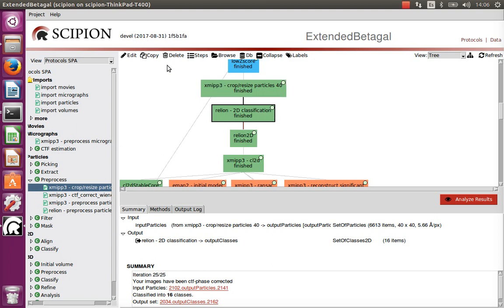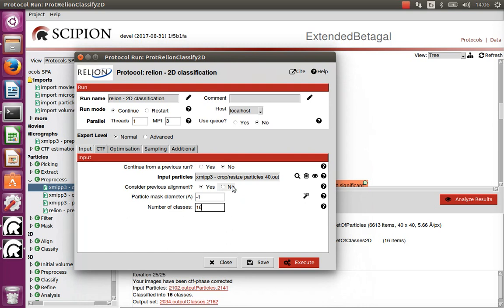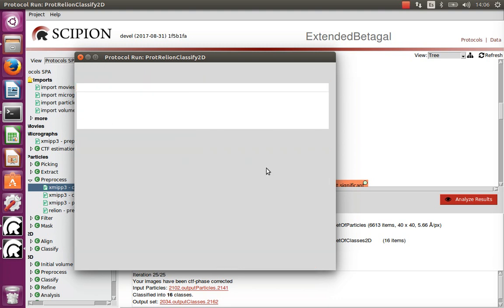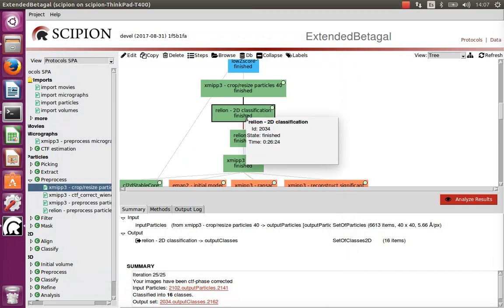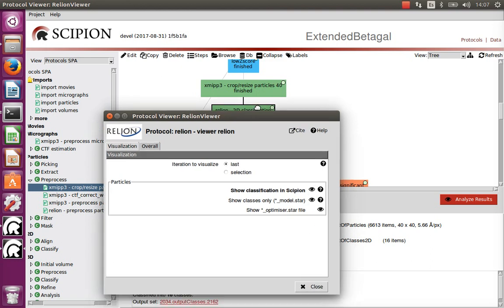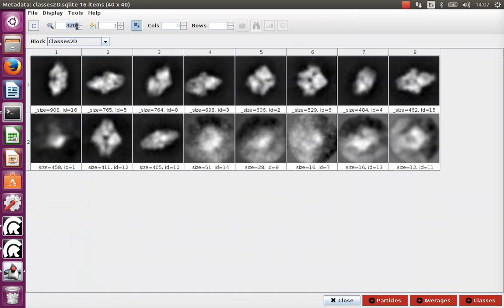The first classifier we will perform is RELION 2D. The main parameters are the number of classes and the set of images you want to classify. RELION has a GPU implementation and a CPU implementation — we have used the GPU implementation in this case. It is relatively fast; for instance, this run was performed in about 25 minutes.